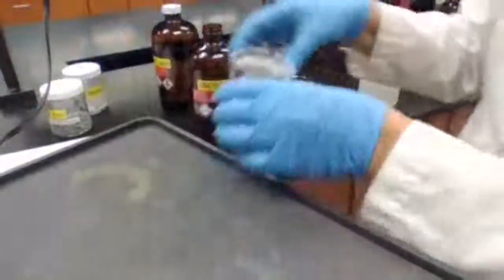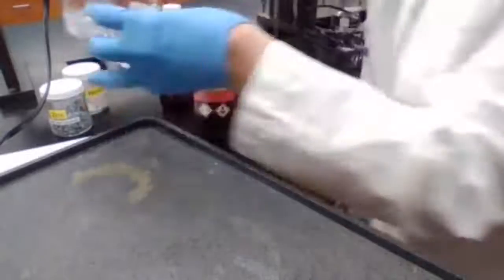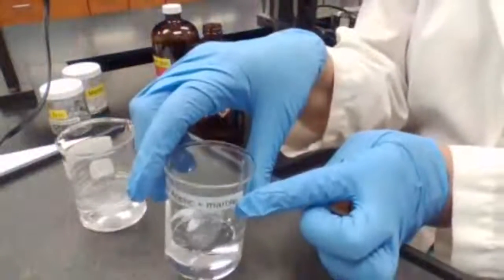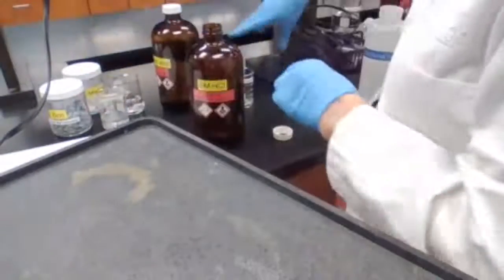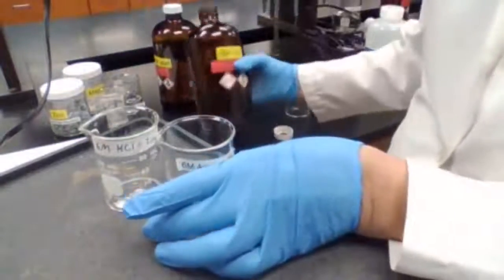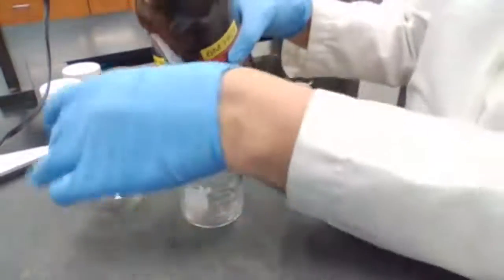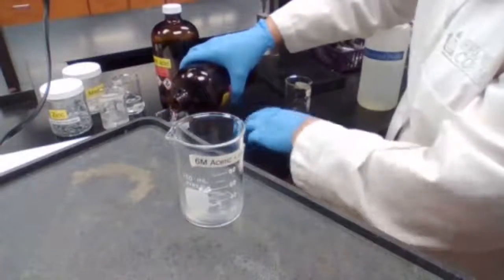A very similar experiment can be done with zinc. This one is the acetic acid plus marble. We see that marble is dissolving in HCl, and marble does not react, or it reacts but very slowly, with the acetic acid. Now we're going to try the zinc also with the acetic acid and HCl.